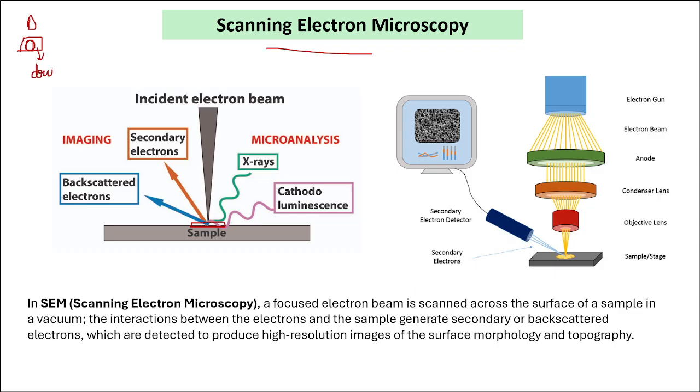Whatever sample you are putting in your scanning electron microscopy, it should be well dried in a desiccator. There should be no moisture. So that is very basic. You dry it, or if you have a powdered sample, what you can do is simply take a glass slide and in both the cases put carbon tape on it.